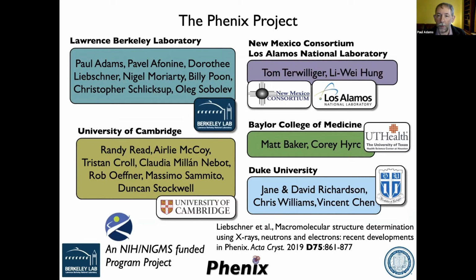Yeah, so I wouldn't mix and confuse two issues, refinement and actually calculating structure factors from an atomic model. For refinement to work and drive your model into the map, it doesn't really need to know form factors and calculate or simulate model maps, speaking of cryo-EM jargon.